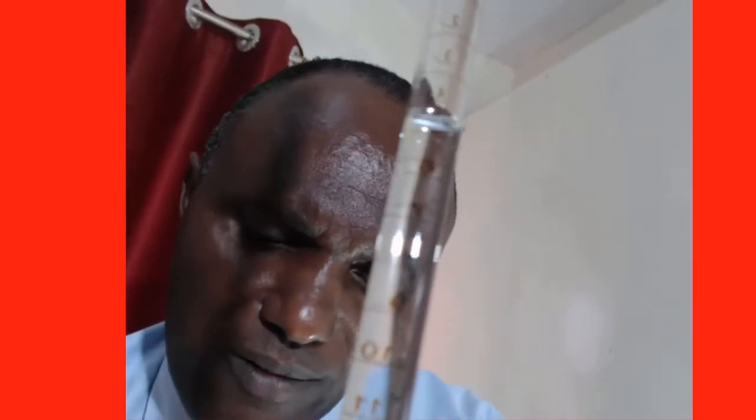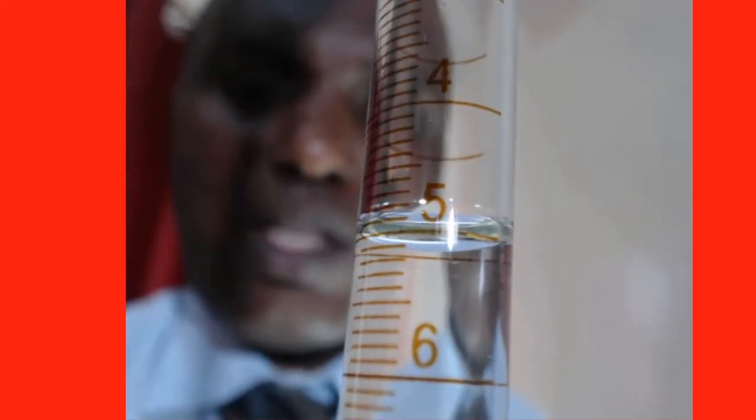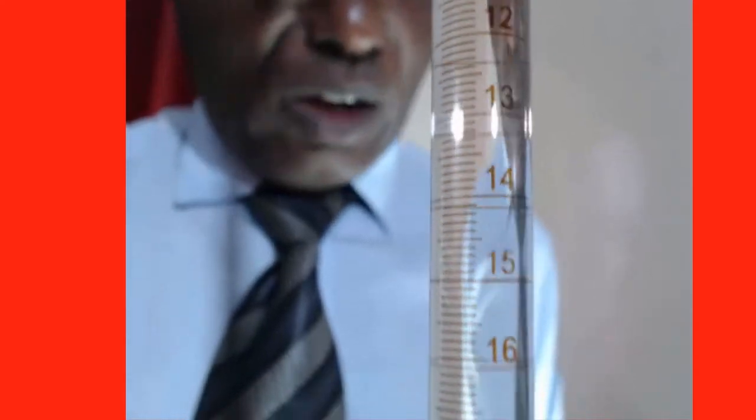Our solution now, we have adjusted it to read 5 cm³. So our burette reading is exactly 5 cm³. I would like now to react the two solutions, as I had told you that we want to react the two.